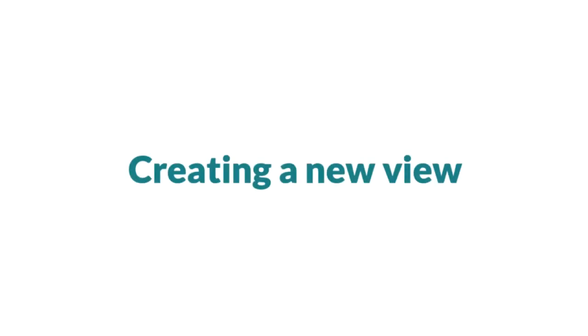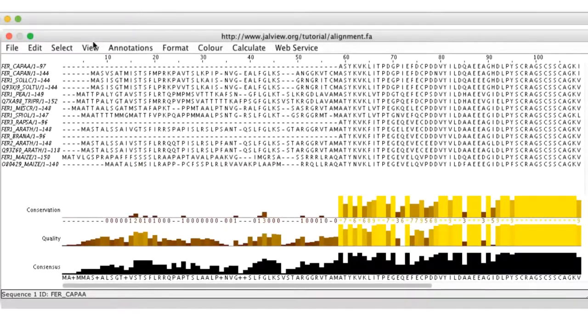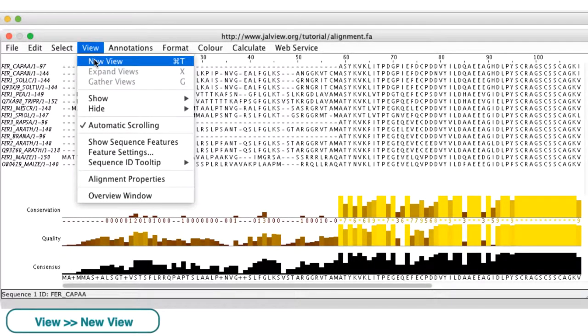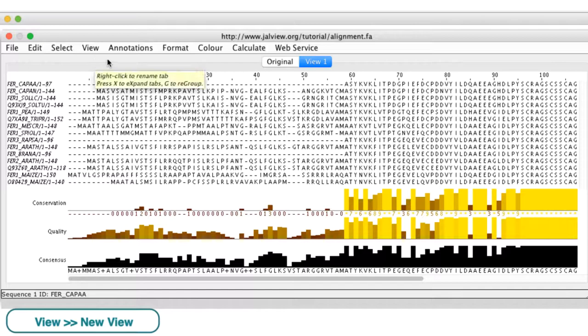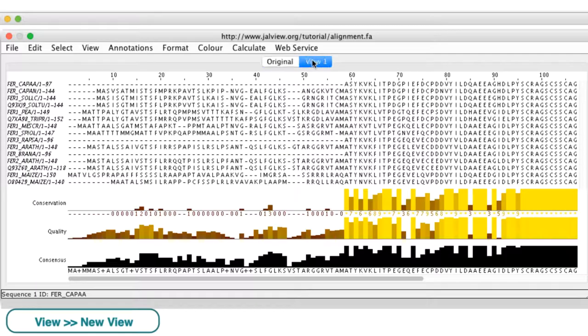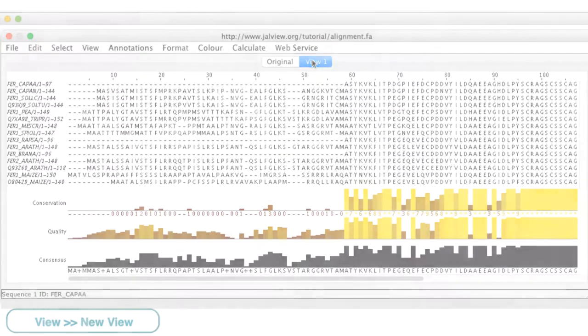Before customizing the alignment, first I will create a new view. I go to the view menu in the alignment window and select new view. Note because each view has the same underlying data, any edits performed in one view will update the alignments and annotations in all the views.